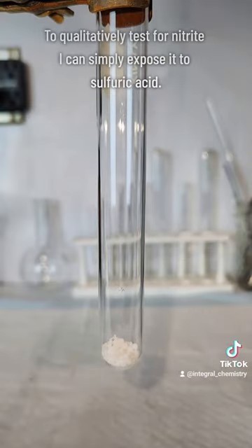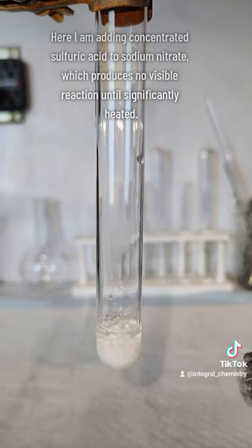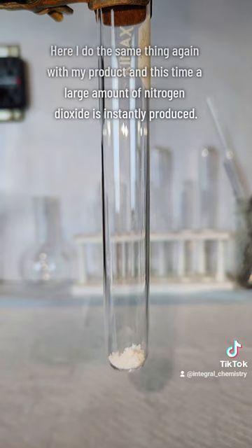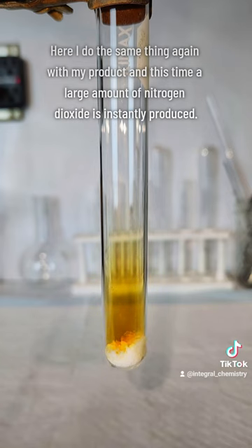Regardless, I want to end this video with a qualitative test for nitrite. To do this, I just add a little bit of concentrated sulfuric acid to my salt. Here, as a sort of control, I add some concentrated sulfuric acid to some sodium nitrate, and this produces nitrogen dioxide gases, but only if a large amount of heat is added. Sodium nitrite, however, is a much stronger reducing agent than nitrate, and will spontaneously react with sulfuric acid at room temperature to produce nitrogen dioxide gases.